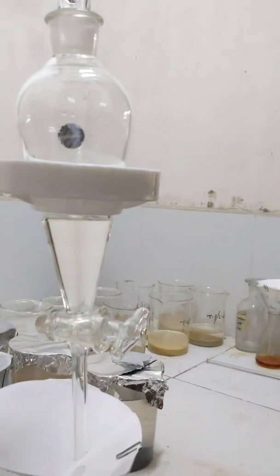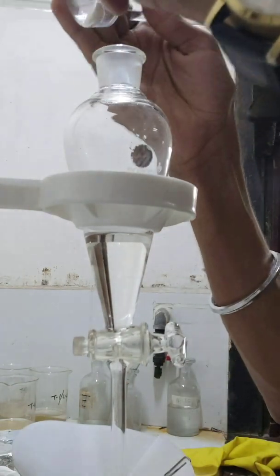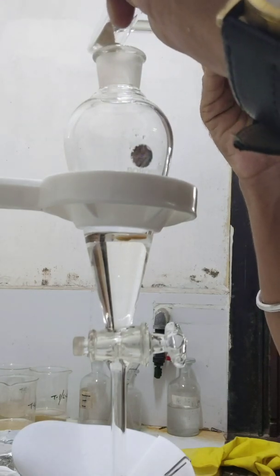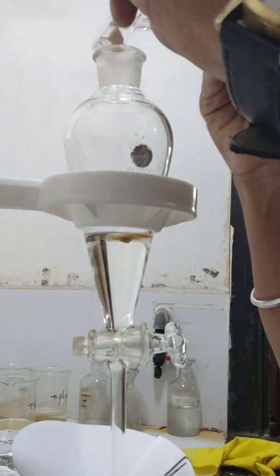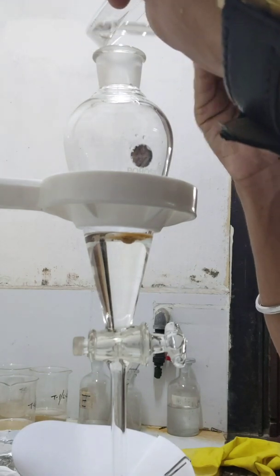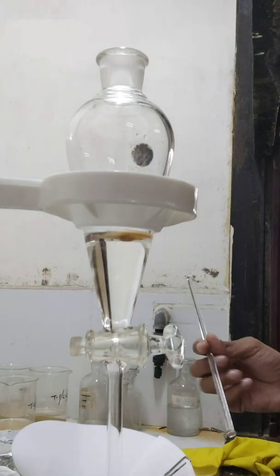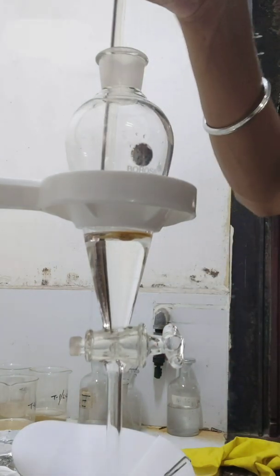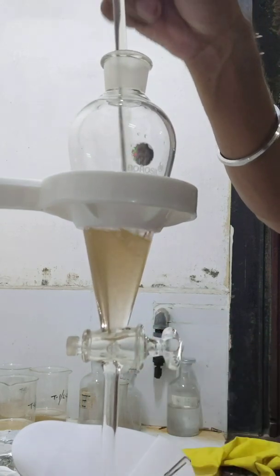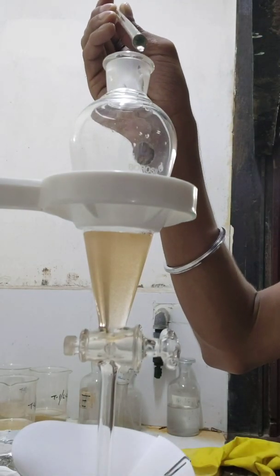So now it's time to pour the sample. Just let us open the container and put the sample into the funnel with the help of a glass rod. The amount of sample may vary. Here I am taking a very small amount of sample, and let us stir with the glass rod to make it kind of turbulent. And every process you have to put in the fume chamber.